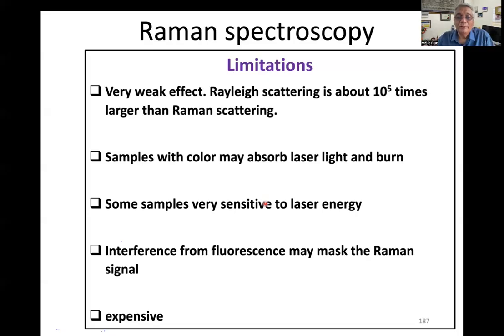So what you're recording in that case is a Raman spectrum of a sample not at room temperature, but at a slightly elevated temperature. There can be changes between a spectrum recorded at room temperature and one recorded at a really high temperature. So one has to be very careful about it.